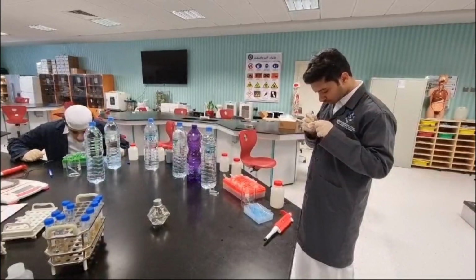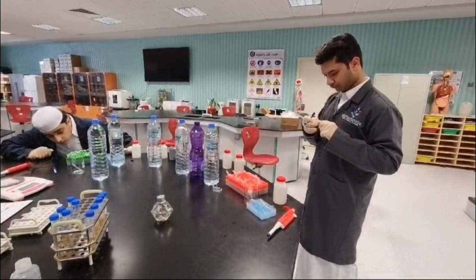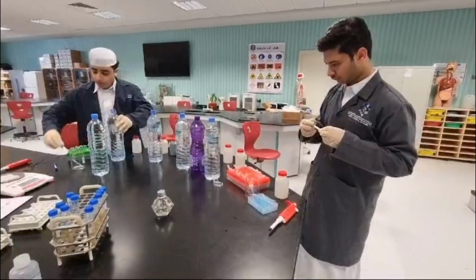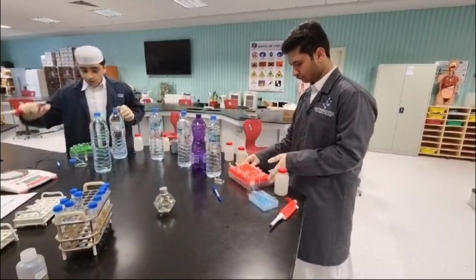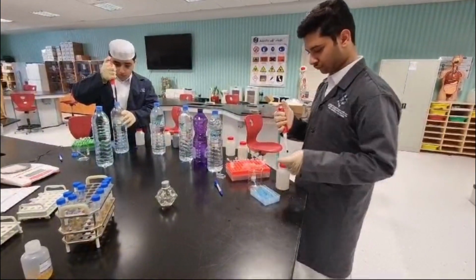In the initial step of water analysis, begin by labeling an empty petri dish with your lab group and the water source. Then, carefully pour 1 ml of collected water into the dish. Label another dish as the control and add 1 ml of sterile water.